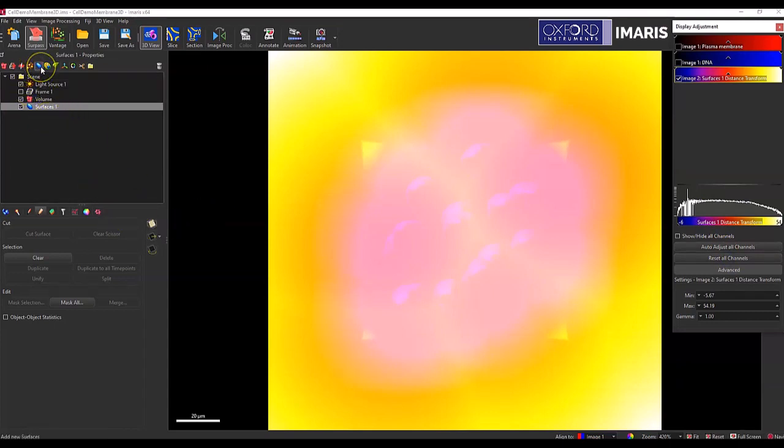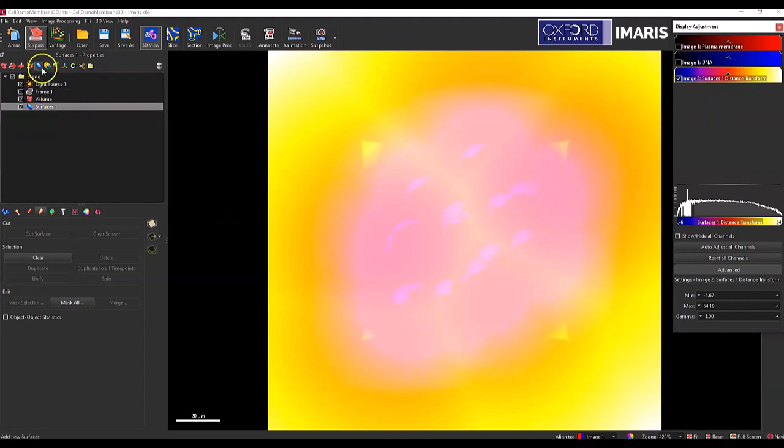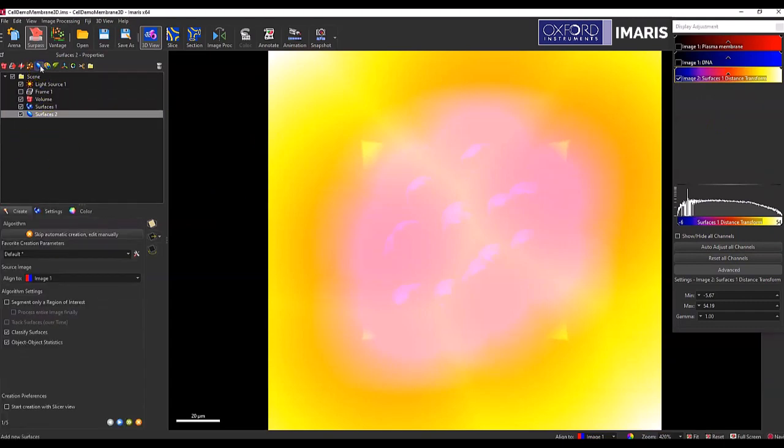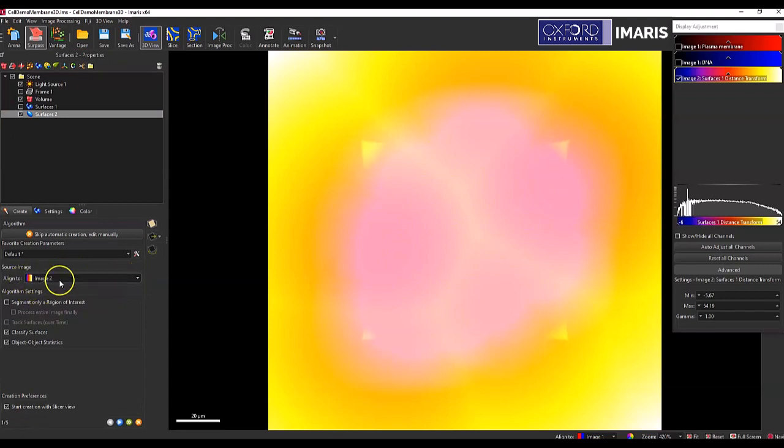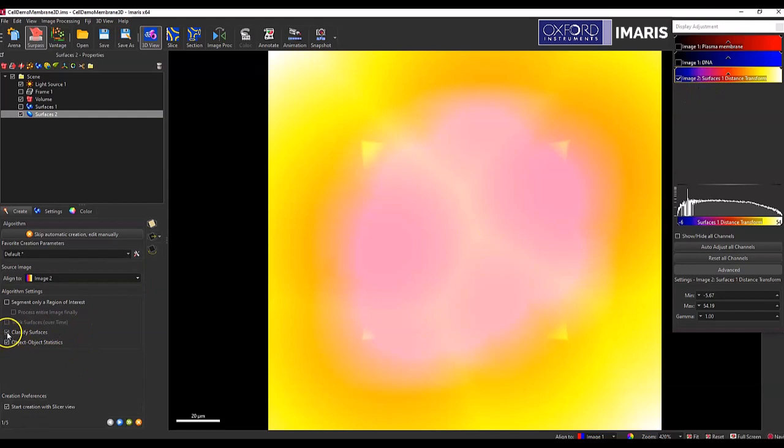And then once I have that distance transformation colored how I would like, I'm going to go back and now create a new surface object that is based on this distance transformation channel. So I'm going to select the correct source image to align to and that's going to be the distance transformation channel.